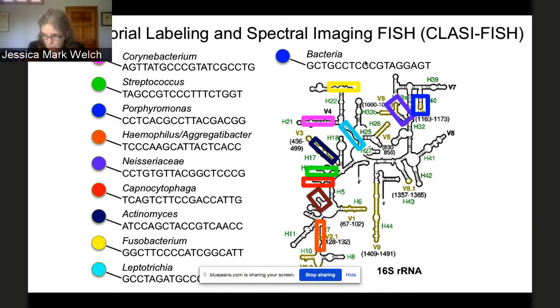So we were worried that you'd get ambiguous signals. If you see 3 fluorophores, you wouldn't be able to determine what kind of overlap was producing that signal. That problem might be a little more theoretical than actual. Anyway, this is where we started, with a relatively simple labeling scheme.